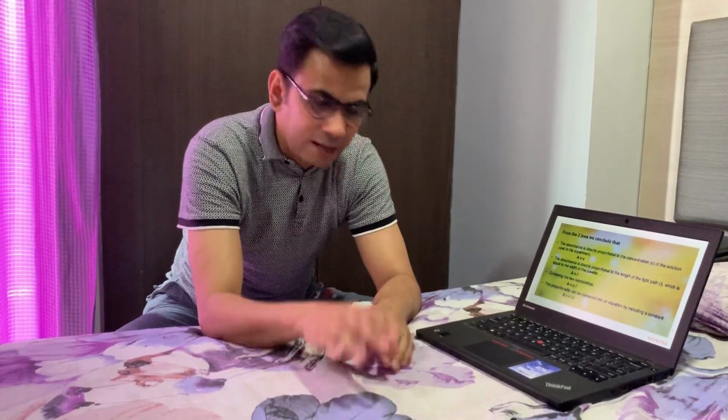So if we take the two laws, we can simply conclude that the intensity of the light decreases with the increase in the concentration of the solute. However, the absorbance of the light means the light will be absorbed more if it has more solute, or a more concentrated solution. So absorbance of the light is directly proportional to the concentration of the solution.